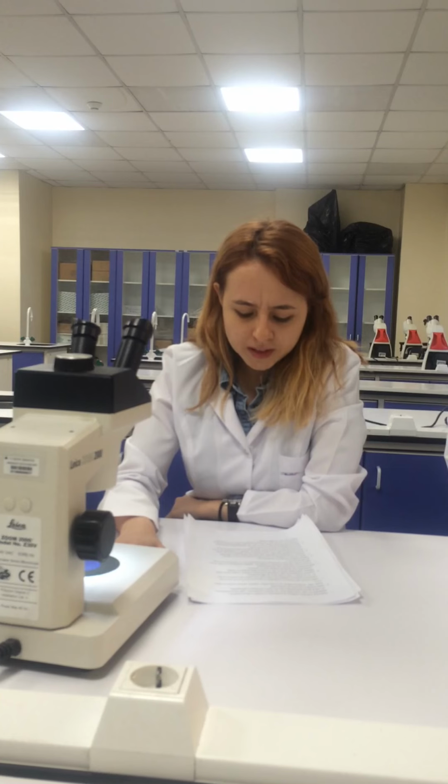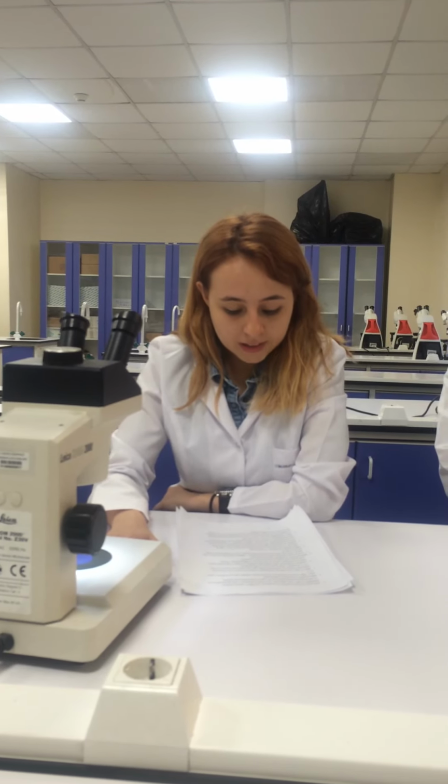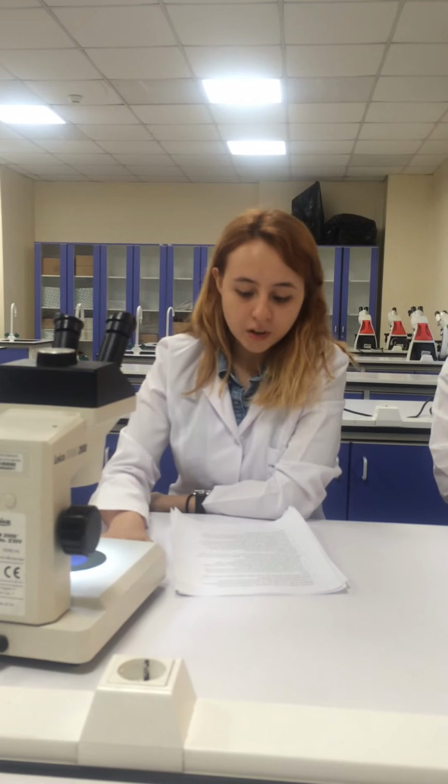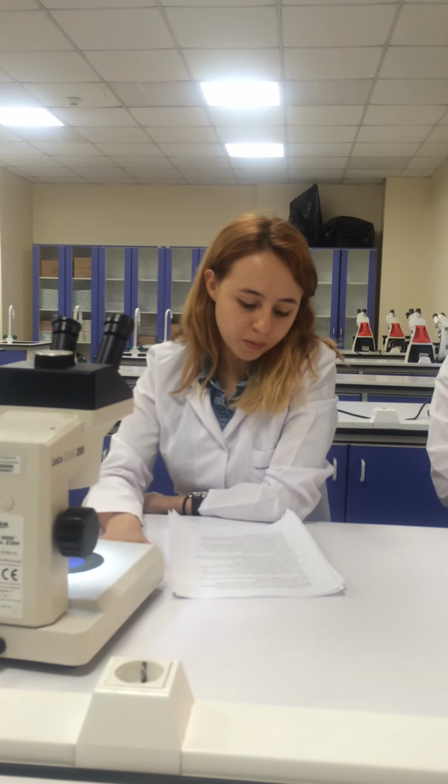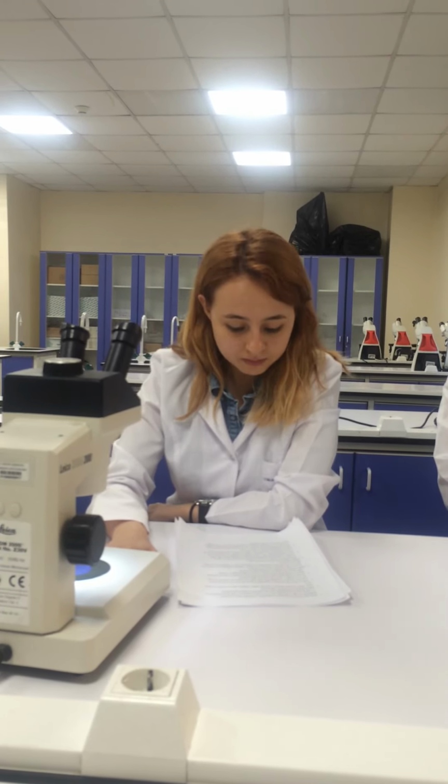Porcine adipose stem cells are collected in 15 ml conical tubes with a density of 2,500,000 cells per tube. A hemocytometer is used to count cells. After centrifugation at 400 G for 7 minutes, the supernatant is discarded without disturbing the pellet, and 1 ml of chondrocyte induction medium is added in a 15 ml tube.